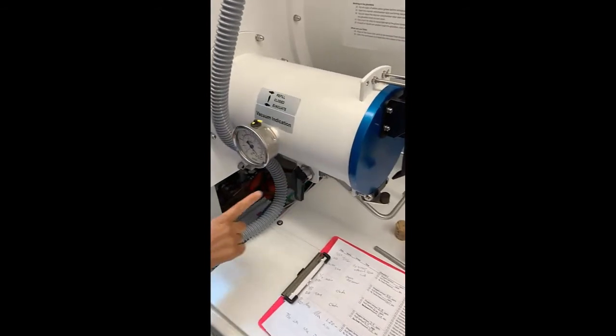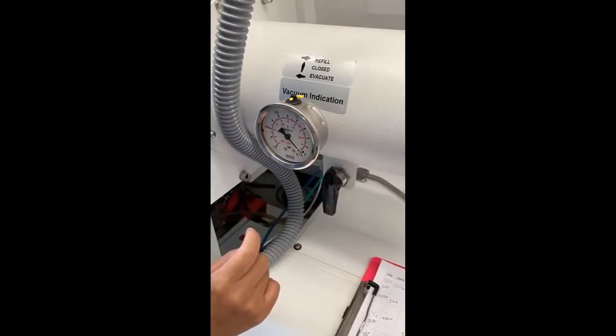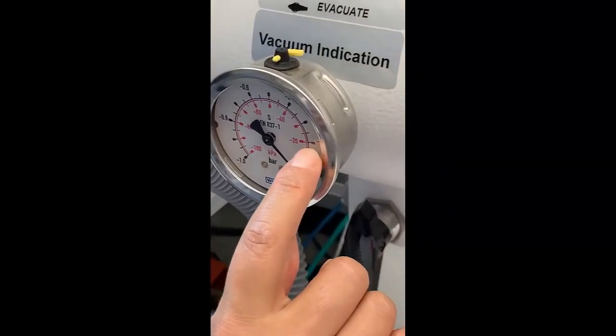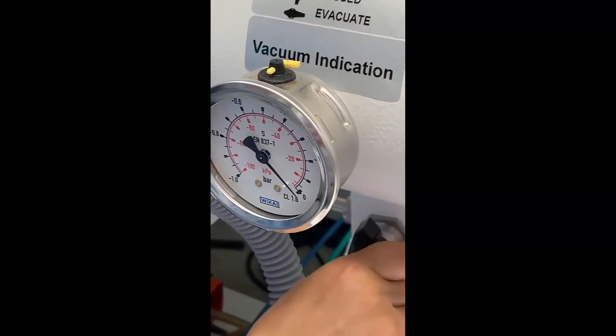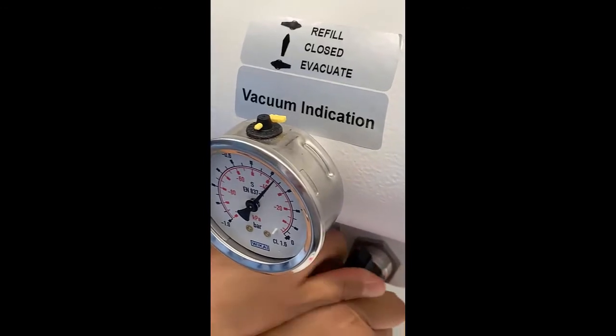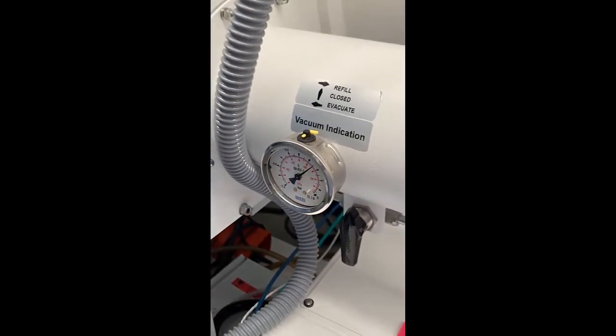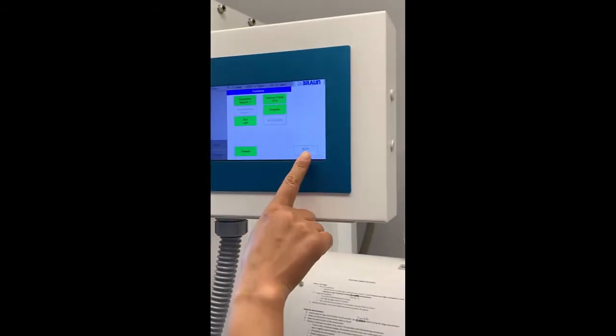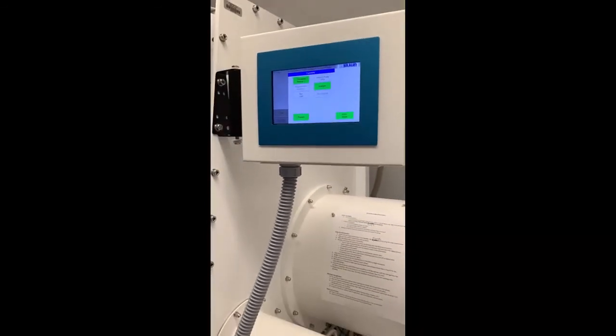And then it is good practice to leave a little bit of vacuum in the antechamber to prevent leaks. So we are going to evacuate until the pressure is at negative 20 kPa. Once there is a little bit of vacuum in the antechamber, all you have to do to turn off the glove box is hit the Eco Mode button, and it automatically shuts everything off.